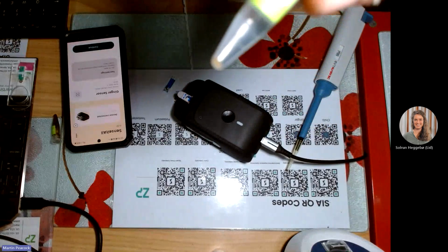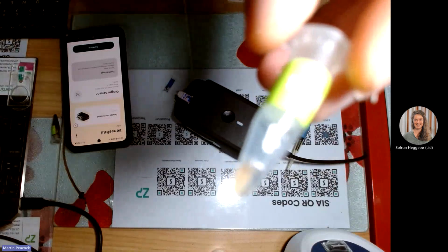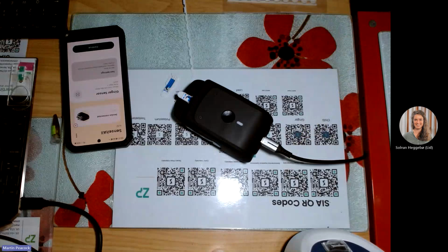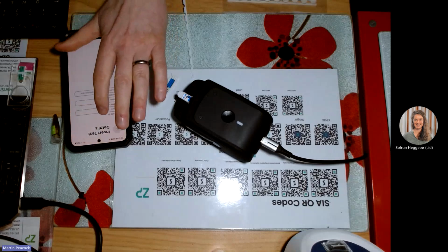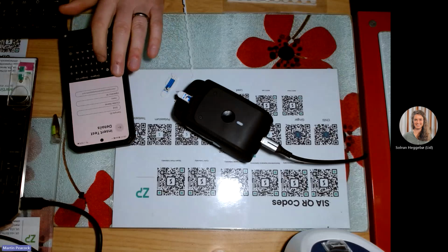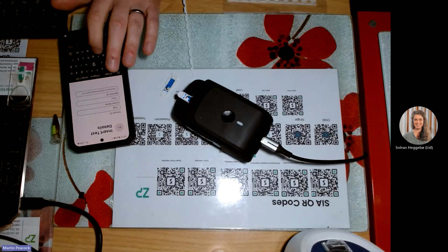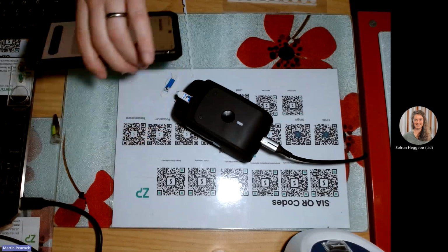Now I know it's quite small on the screen, but there's actually just a little bit of insoluble material at the bottom of this. And that's one of the powers of electrochemistry. Unlike other analytical techniques where the sample has to be really quite purified, filtered, centrifuged, maybe gone through a column, electrochemistry is a much more robust analytical science than people are used to. So I'm just putting a name in here because I want to be able to find this data later on.